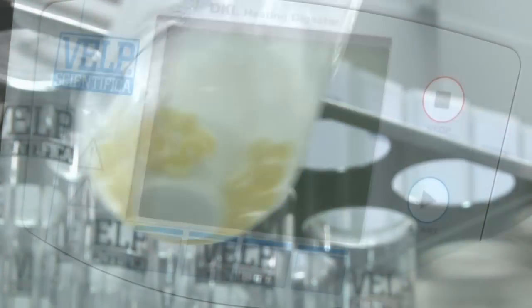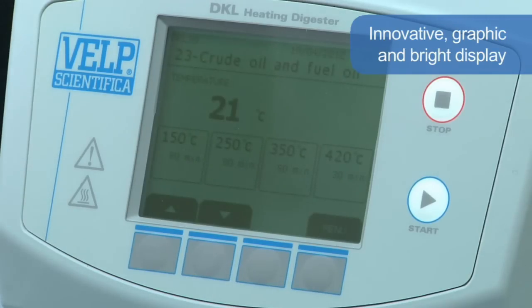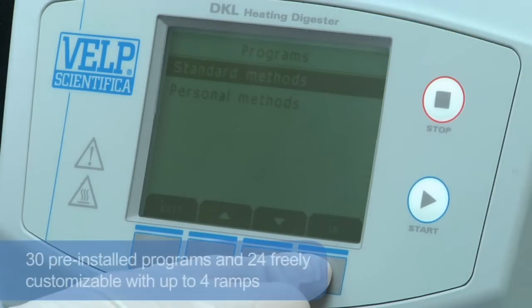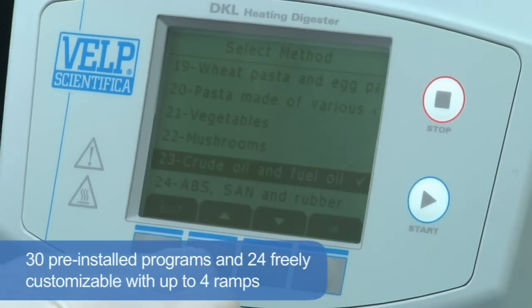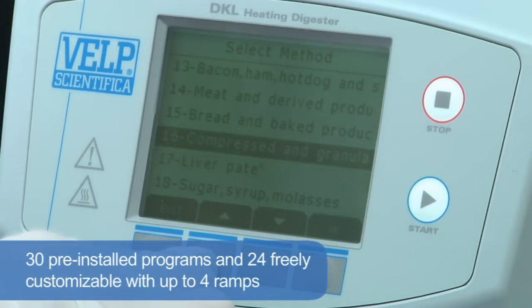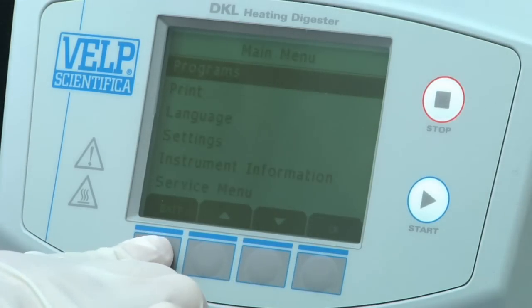An innovative graphic and bright display guides the user in a simple and fast way, planning and monitoring the various digestion phases. A 30-program library is pre-installed according to the most common applications. 24 programs can be freely customised with up to 4 ramps for digestion of particular samples.